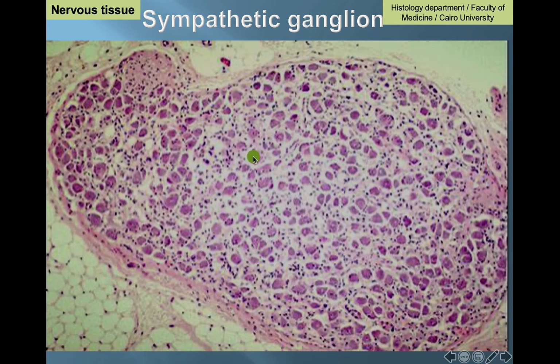Here the shapes are not globular or rounded, they have pointed ends due to the emerging dendrites from this multipolar nerve cell. Here we have sharp or acute angles due to the dendrites coming out from the perikaryon, as these nerve cells are classified as multipolar stellate.